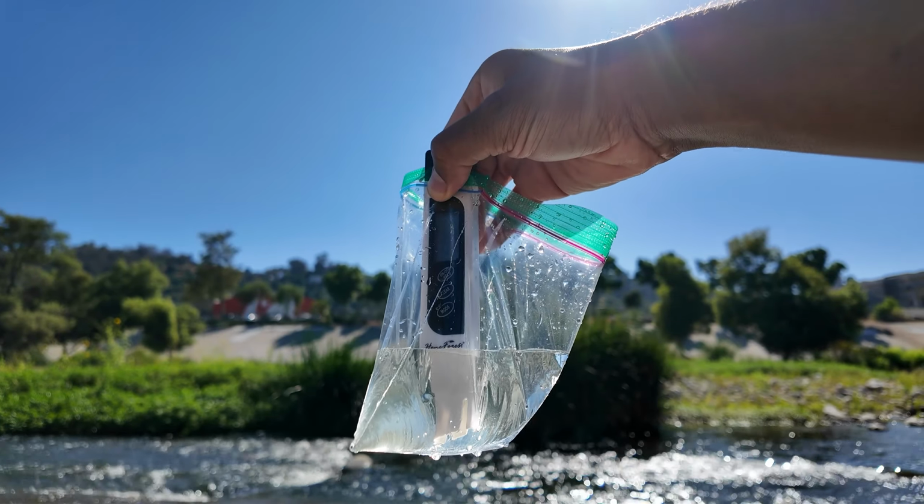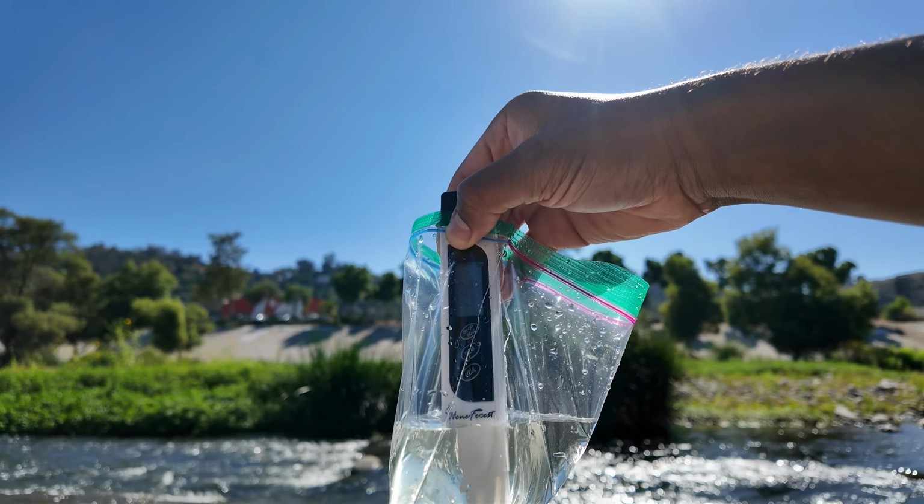So this is what that experiment looks like when I suspend it in the bag, and the reading for this is also 580. So about the same as our first reading. And I'm guessing that would suggest that this is not enough turbulence to really clean up the water substantially. So we'd either have to go maybe further upstream of whatever sources, or an area where we have even more turbulence and perhaps a deeper pool of water.